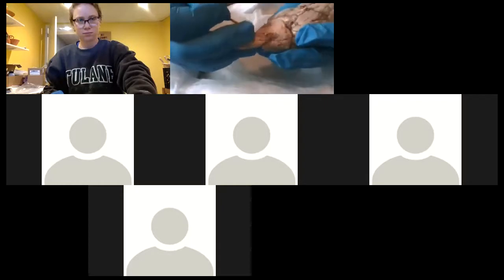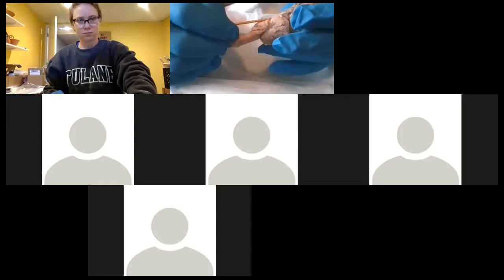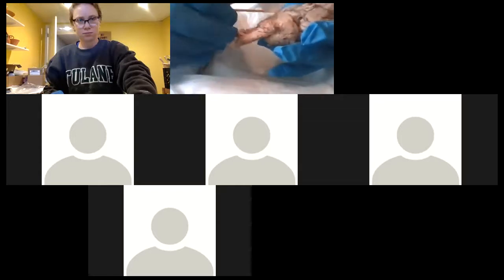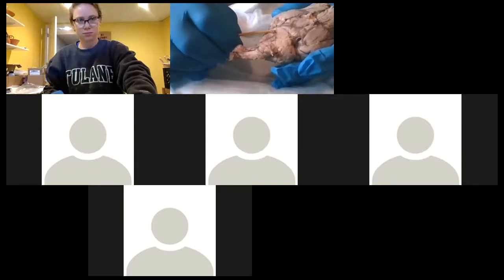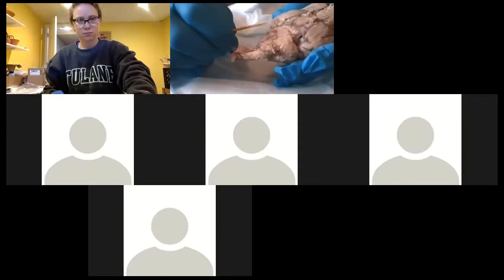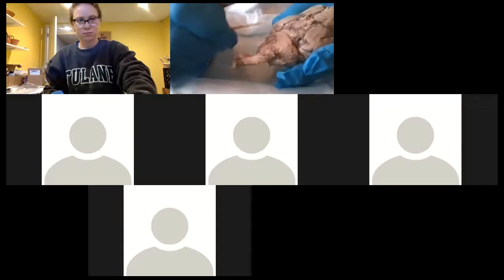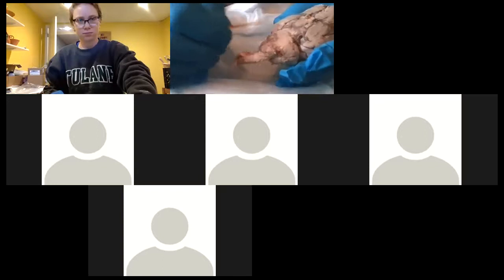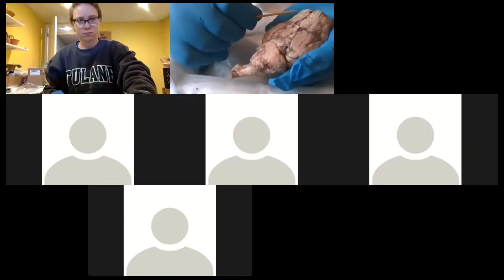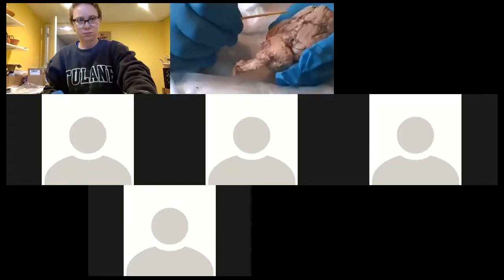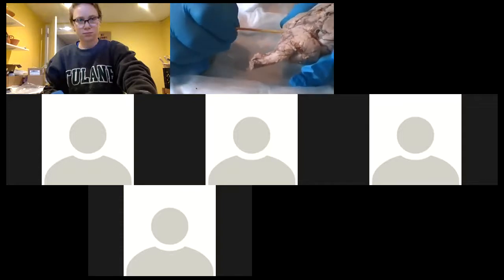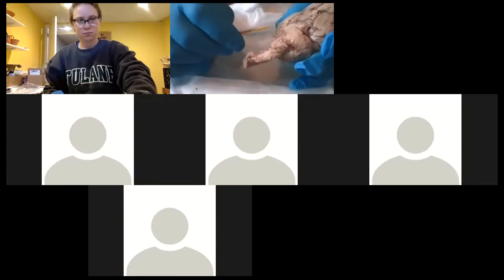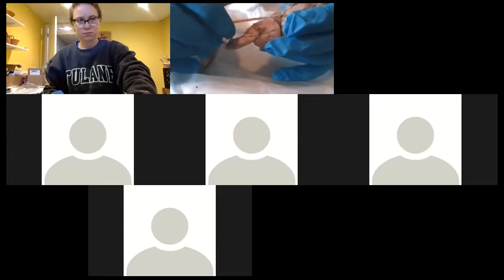Sometimes you could see some cranial nerves, but they're really hard. I would have to spend some time. You would have to spend some time dissecting this tissue very carefully to see if you could see. Sometimes the trochlear nerve will pop out over here, abducens actually. This is the abducens nerve, which is a really boring cranial nerve that controls one eye muscle. So you're learning the eye muscles now, you're learning the eye structures now. And for our practical, the eye structure is very rudimentary view of all the special senses. But you should be able to follow it back to the nuclei, and most of that is in the brainstem, except for olfaction, which is up here, starts in the frontal lobe, goes to the temporal lobe. And your vision optic tract goes to occipital. But most of your cranial nerves are all brainstem oriented between the pons and the medulla oblongata. So they branch off. You might be able to see cranial nerve five if you actually dissect it out. But that would take a really long time, you have to be really careful.